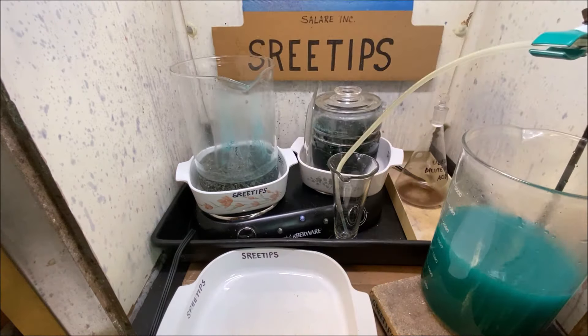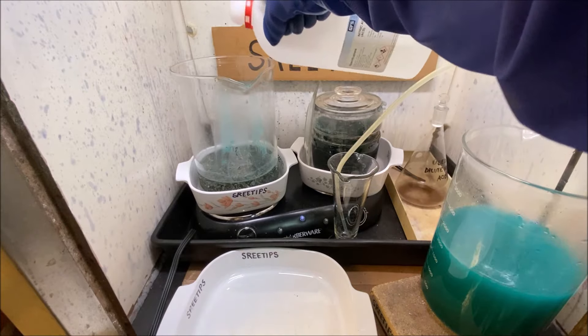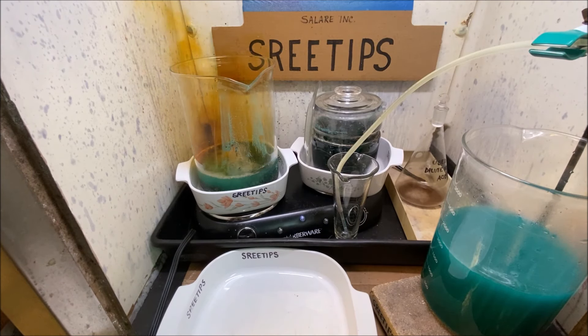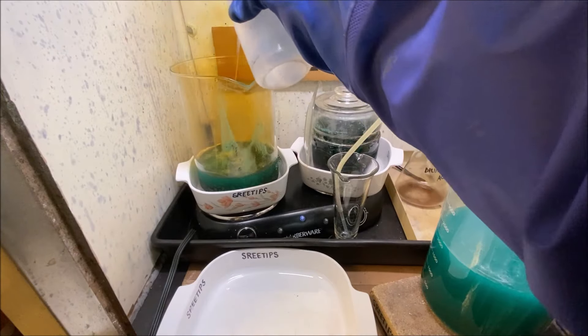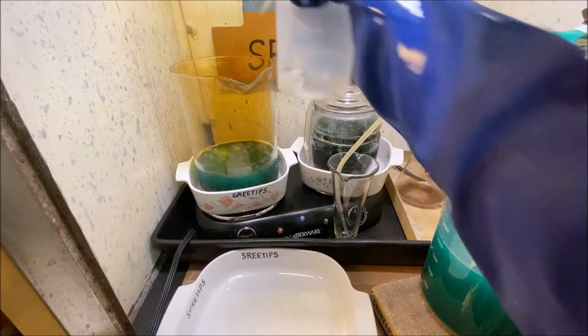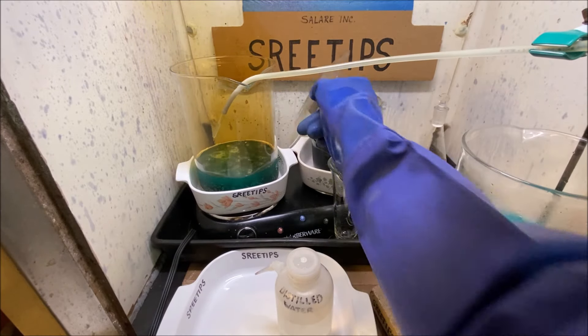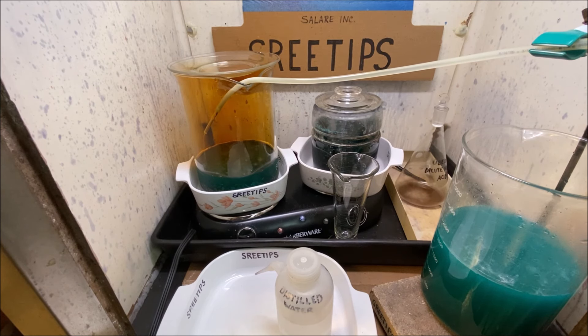We're producing a lot of waste here — I'm really not set up to refine this much metal all at once. I'm adding some distilled water, then putting nitric straight into the beaker to get this reaction rolling. I'm reinserting the delivery tube and starting the flow of nitric acid from my funnel — there's a little trickle coming out — and we'll just let this trickle down in there and continue to react.